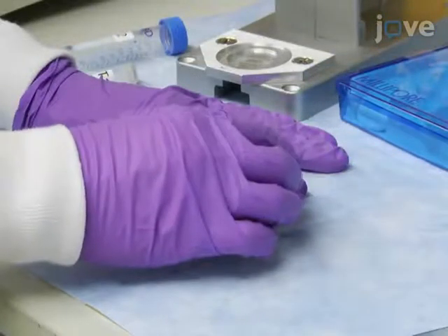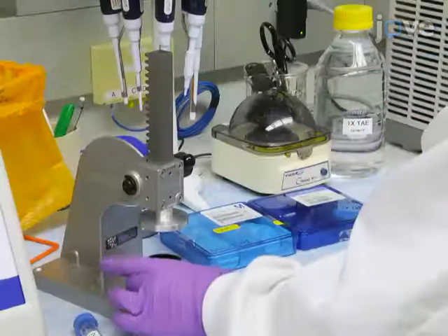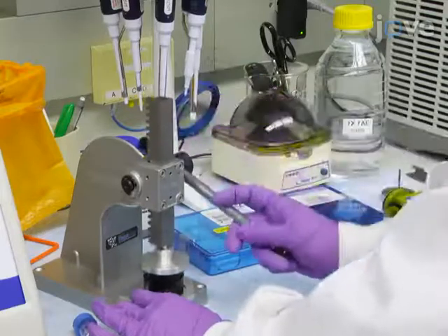After assembling, seal the filter cassette by inserting the extension cowl and pressing it down tightly and evenly with a manual or pneumatic press.